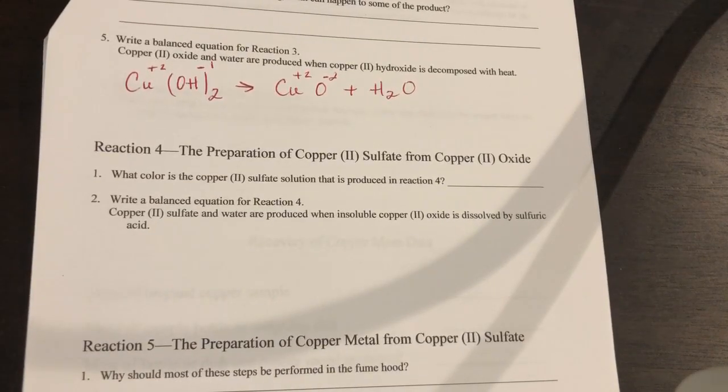What color is the copper 2 sulfate solution that is produced in reaction 4? It's going to be the dark brown solid on top and light blue on the bottom. Remember, we convert that back to the light blue.